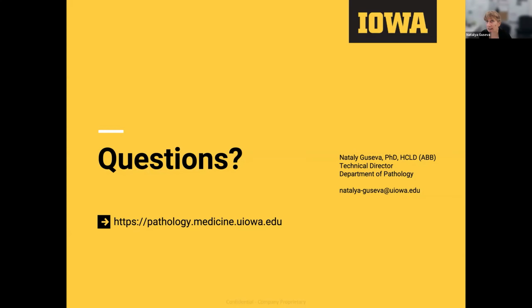So generally, like I showed on my slides, our analysis goes through the Archer Analysis provided software. We have it on a virtual machine here. We don't go to the cloud, but for interpretation and finding and QC, we rely on Archer Analysis. And it was sufficient for us so far. Archer Analysis allows detection of the specific breakpoint for fusions. It already does all the annotation, all the secondary analysis.